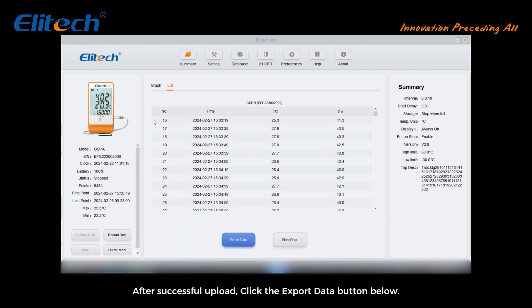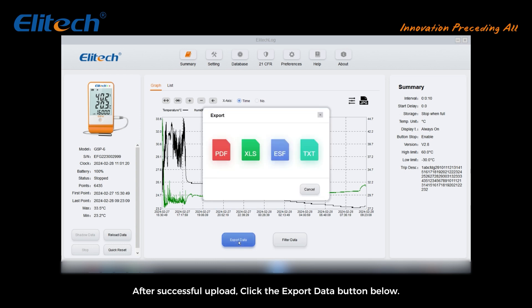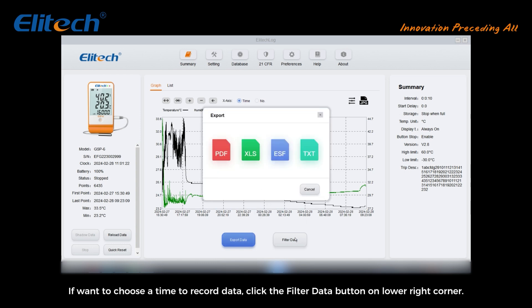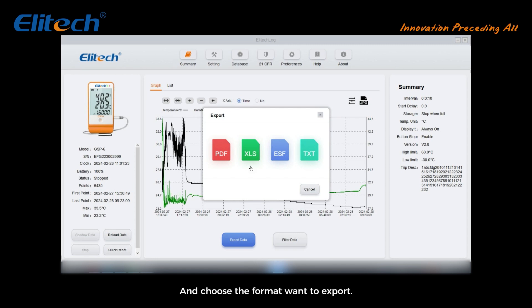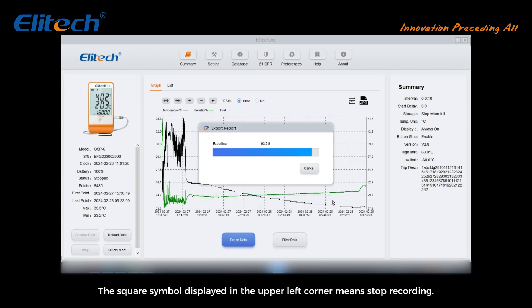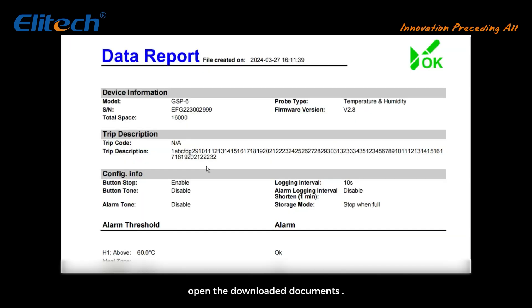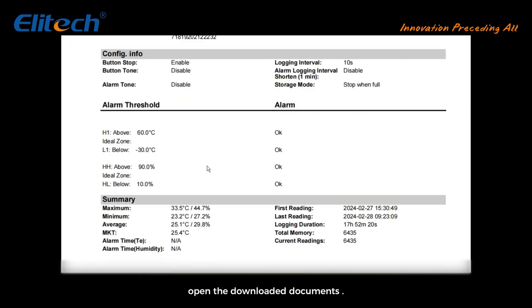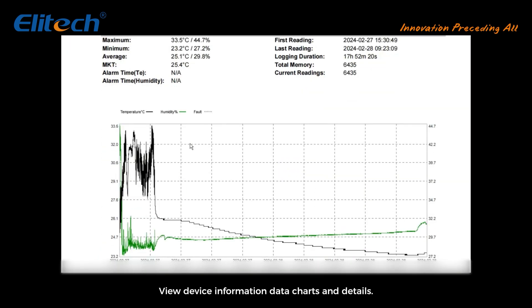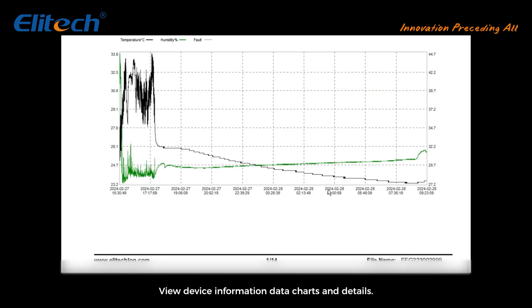After a successful upload, click the Export Data button below. If you want to choose a specific time range, click the Filter Data button in the lower right corner. Choose the format you want to export and select the download location. Then open the downloaded document to view device information, data charts, and details.